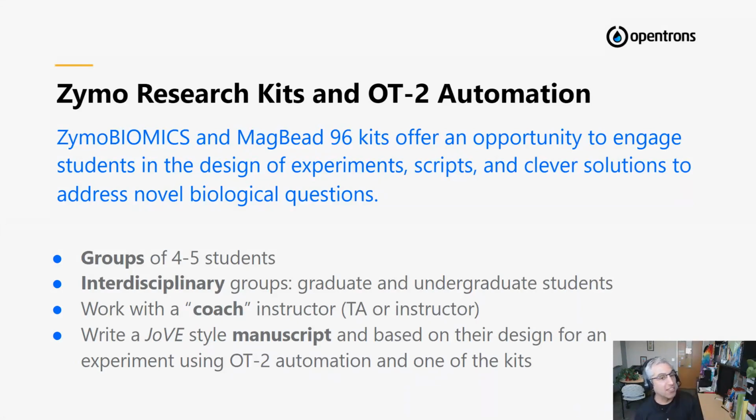So students watched the JoVE videos throughout the semester. We had one every other week. And then their task was to address a biological question that the instructors came up with using one of the kits, Zymobiomics or MagB96 for DNA or RNA. We told them about the protocol designer, and we helped coach groups of students to design and develop and write a manuscript that they had to submit at the end of the semester.